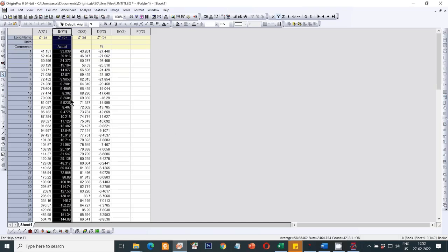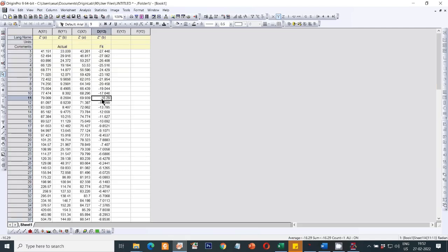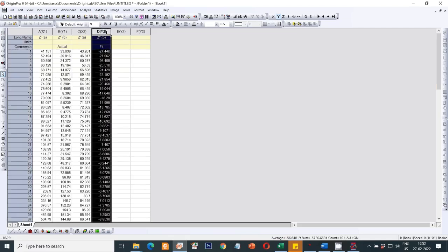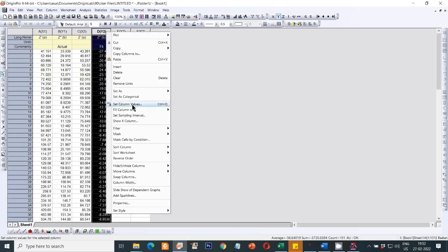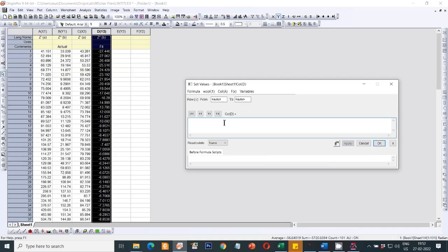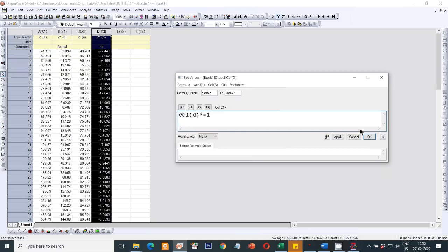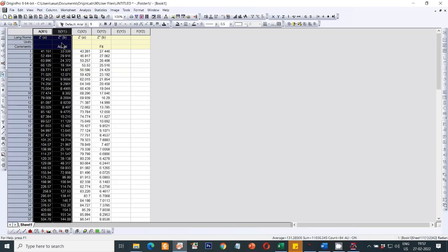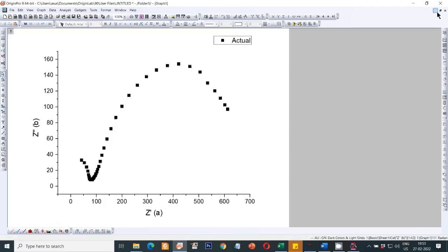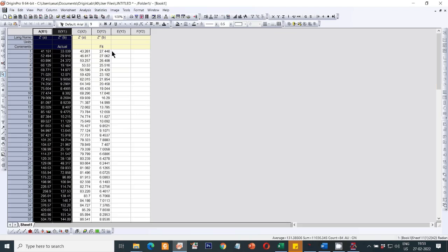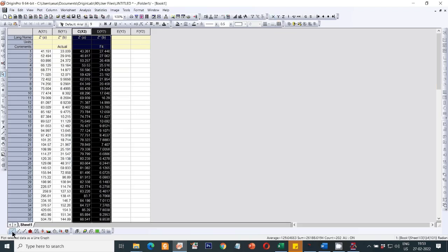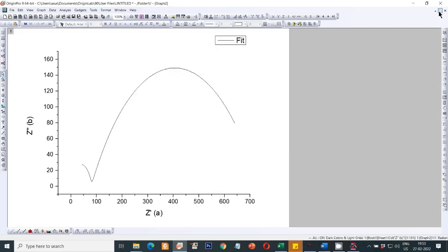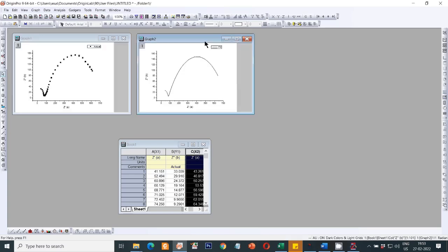Plot the actual data as a scatter plot — this is the first graph. Plot the fitting data as a line plot — this is the second graph. Then you have to merge them.